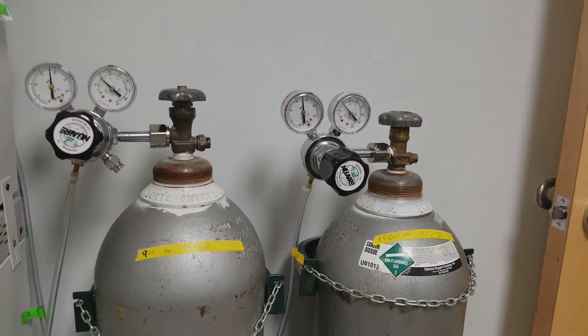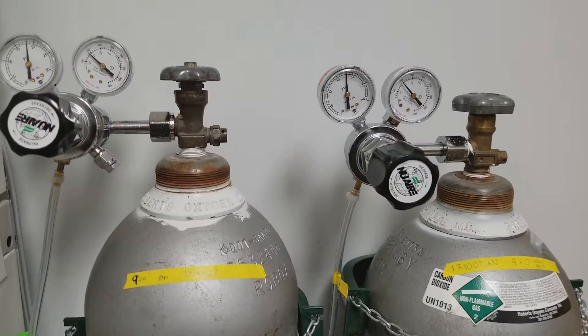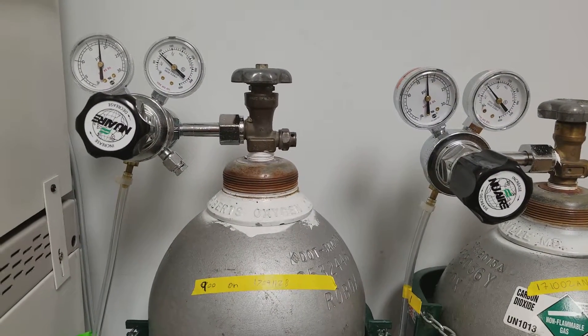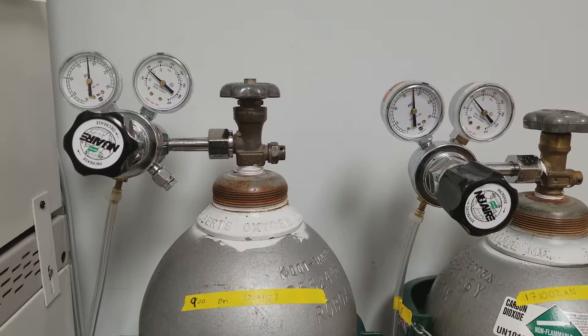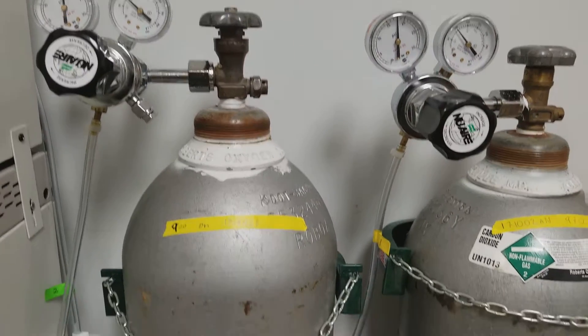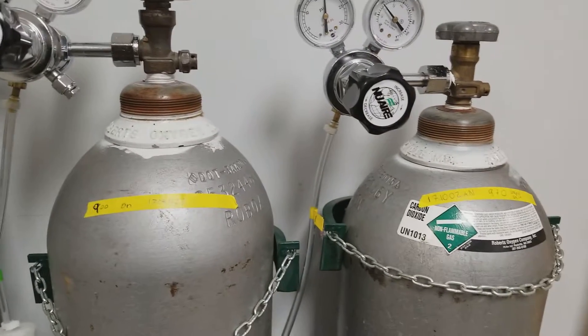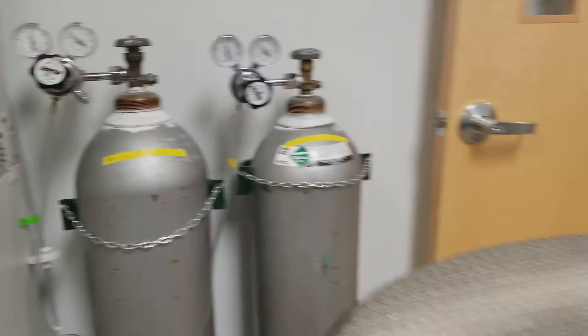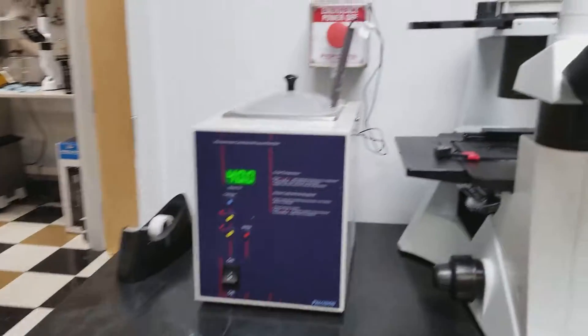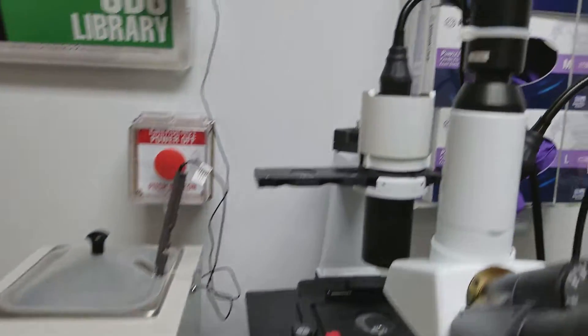Distilled water looks good in there. I'm gonna show the CO2. Both seem full, which is amazing to me because it's been 20 days. At this point last month we were getting a new one.